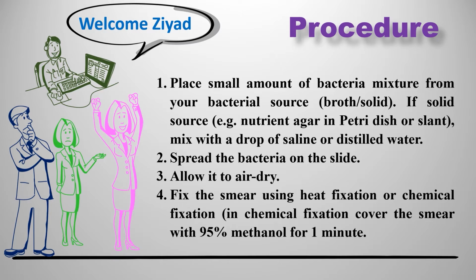If not, if your bacterial mixture comes from a nutrient agar or from a slant, you need to put it into the circle on the slide, and then you mix it with a drop of saline or distilled water. Then you mix them together and then you spread them.